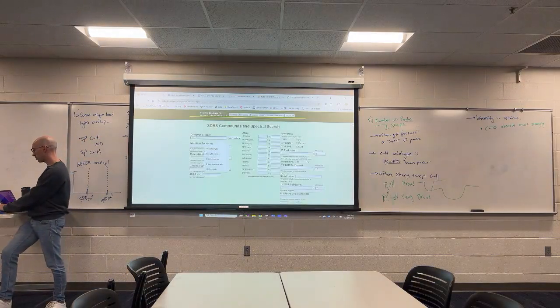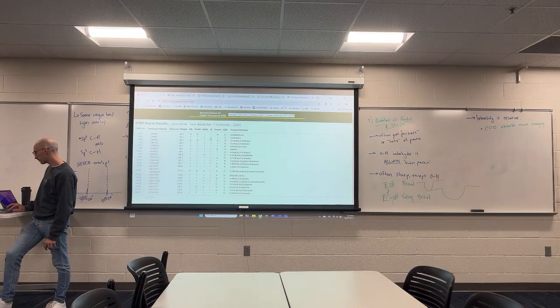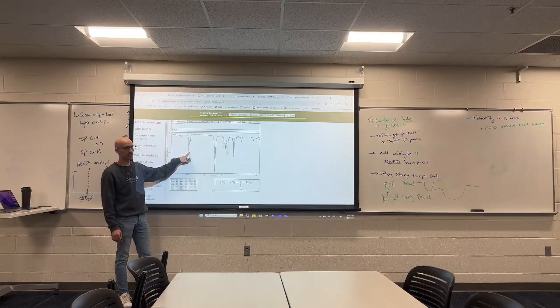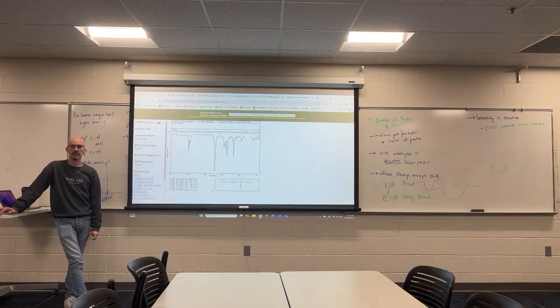That's not going to change when we look at butanone. Butanone has a ketone. Relative to the CO bond, butanone looks like the sp3 is more medium. This is one of the worst characteristics of IR, is that depending on the types of bonds present, other bonds change their intensity relative to it.